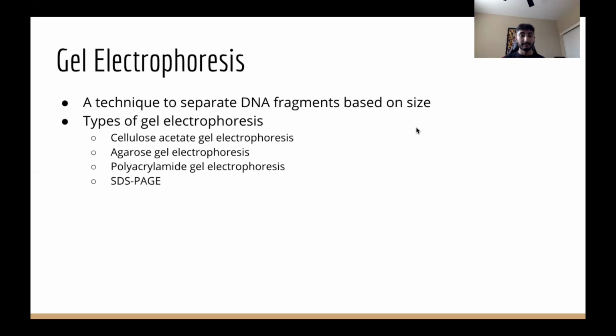When SDS meets with the protein, SDS's hydrocarbon tail dissolves any hydrophobic region of the protein, while the sulfate ends break down non-covalent ionic bonds. This causes the protein to lose its secondary and tertiary structure and causes it to unfold.